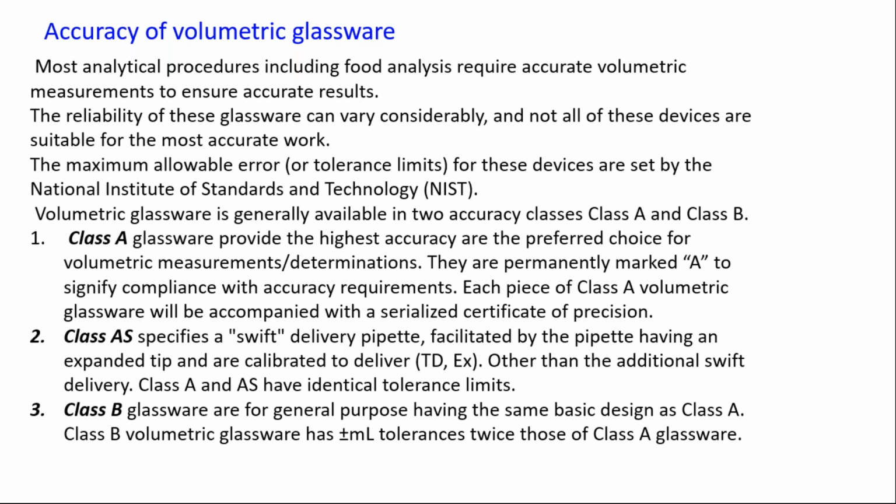So the glassware that you use in the lab has to be very accurate, and it should be made of the glass that is required for that particular glassware. In volumetric glassware, as in any measurement, there can be errors, so there is a certain standard deviation and error.